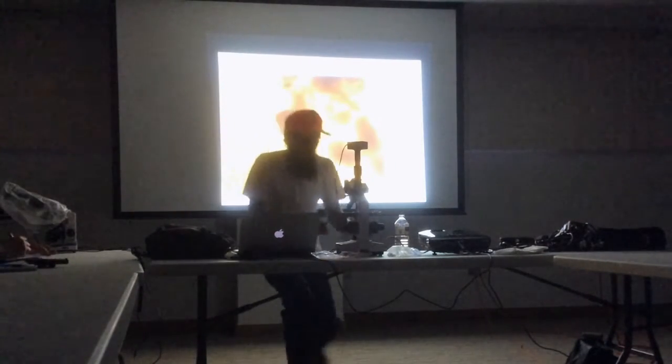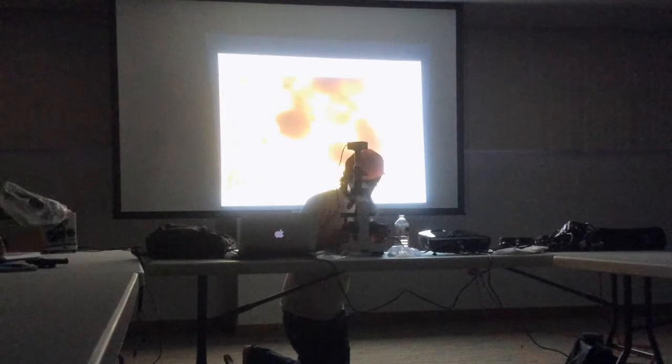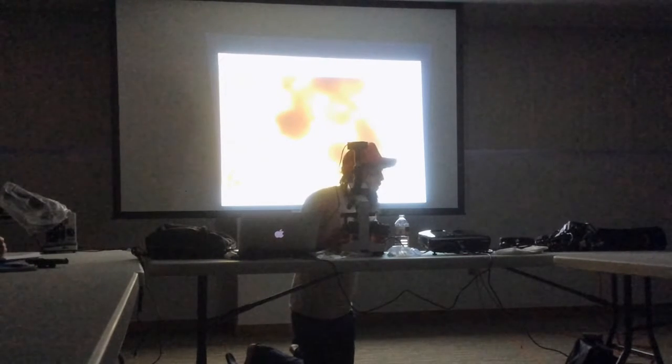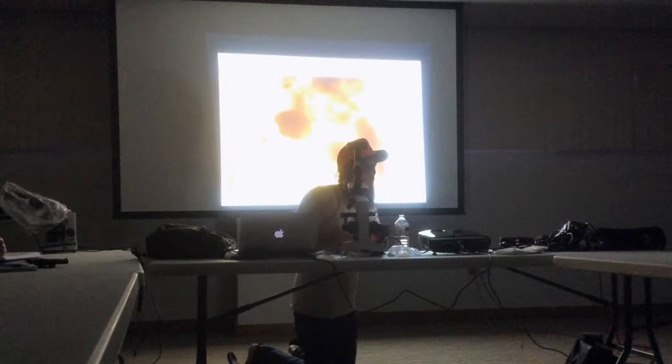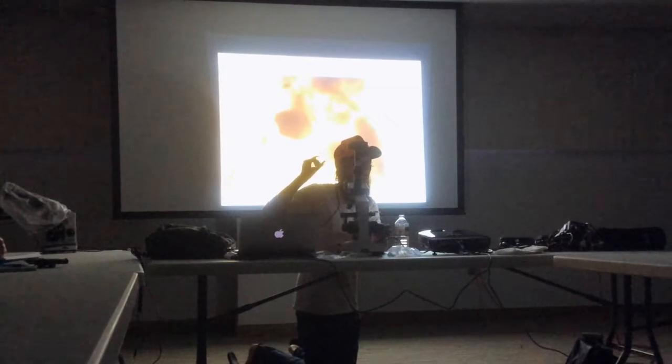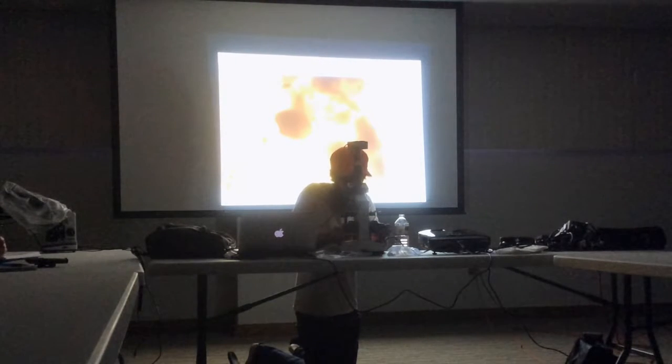Can you see what I'm doing? I'm scrolling in and out, zooming in and out. When you find a fungus, you want to zoom across it to make sure that the edges are parallel the whole way, because then you know it's actually a fungus and not just an antenna or a leg or something else. Those tend to be more round.